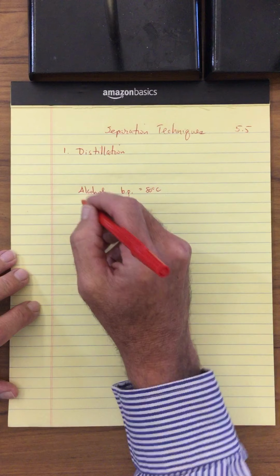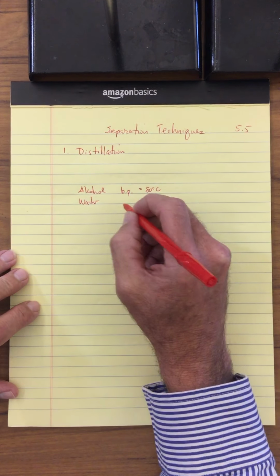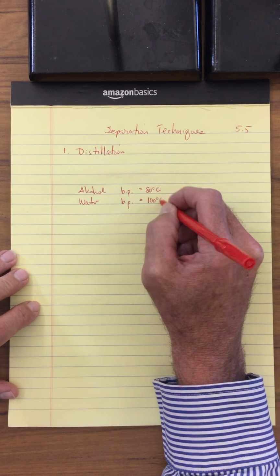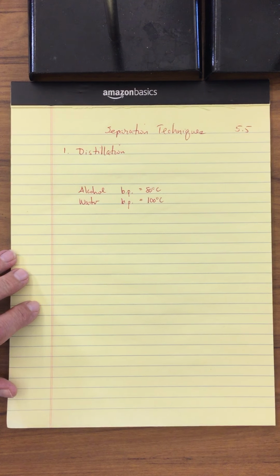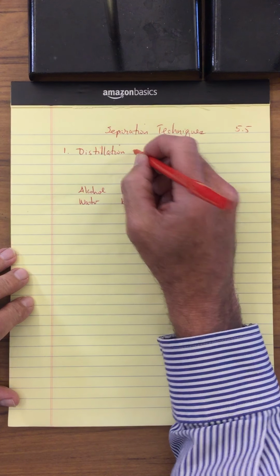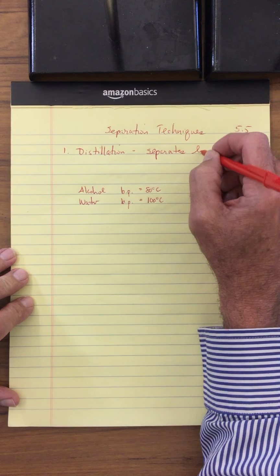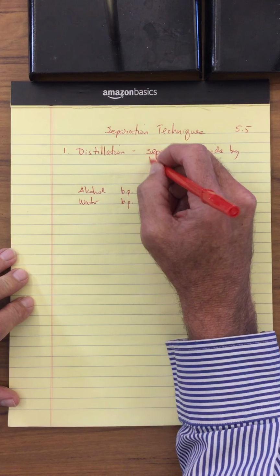Now we're going to mix in alcohol and water. Water has a boiling point, if you remember, of 100 degrees Celsius. What we are going to try to do is have the alcohol and water together as a mixture, and we're going to try to separate them. And that's what distillation is. It separates liquids by their boiling points.